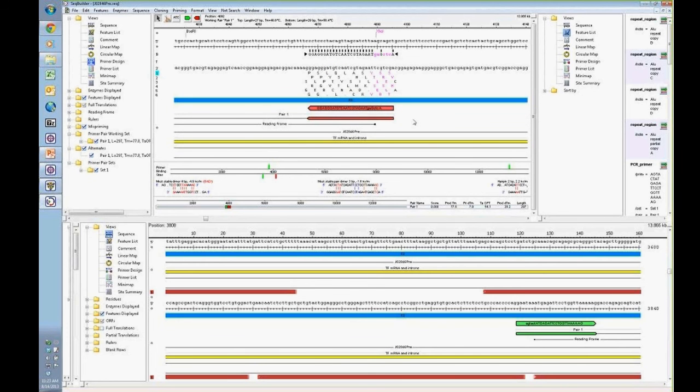So now the next step is you want to start manipulating this primer to resolve the stable dimer information that's being supplied here, as well as to try to get rid of these false binding sites that exist across this target. So this is actually showing you the entire target, not just the highlighted region, the intron that I'm working with. As you can see here, this is roughly a 13,000 base pair fragment. So it's showing you the possibility where these primers may falsely bind on this target.